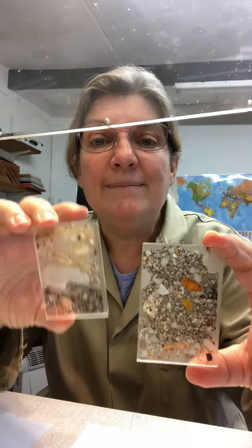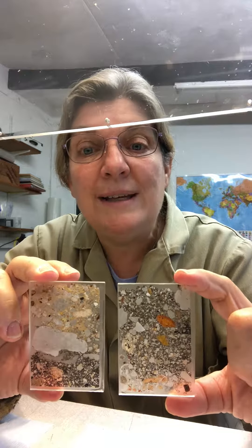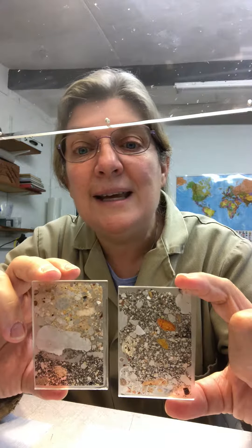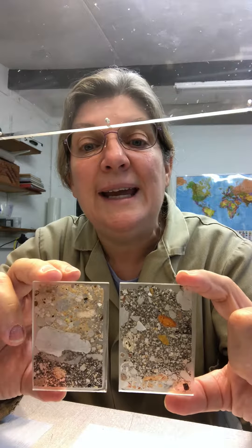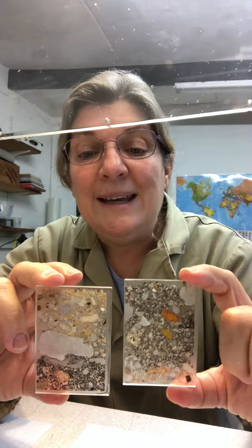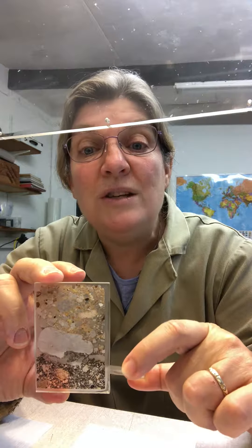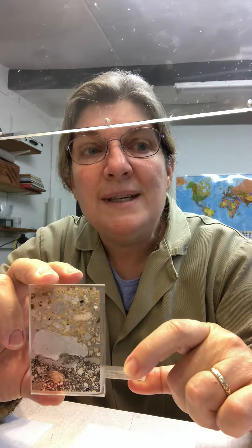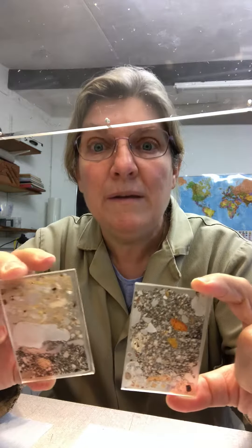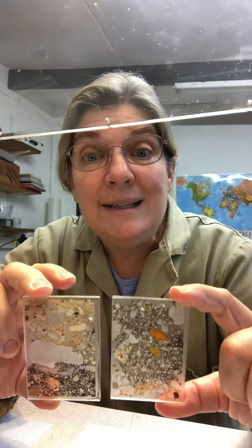Let's go to our double slide samples. And they are beautiful, but what a challenge. Look at the size of that quartz pebble — we're not talking even millimetres now, we're talking centimetres. I wager that's probably five centimetres in width, dividing a light buff context to a dark, organic, softer, sandy silt with our rocks.